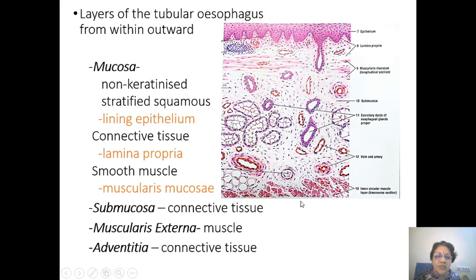Now in this we said mucosa has lining epithelium, lamina propria, muscularis mucosa. So that is the demarcation between mucosa and submucosa. It is pretty vague. If you want to notice muscularis mucosa, we need high magnification, at least 400x, to be able to see it like this. Then this would be the area where the lining epithelium, lamina propria, muscularis mucosa end, and therefore submucosa begins. There's no special demarcation between the 2 connective tissue domains.